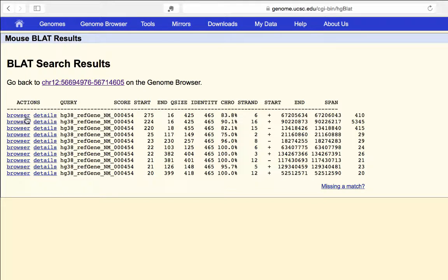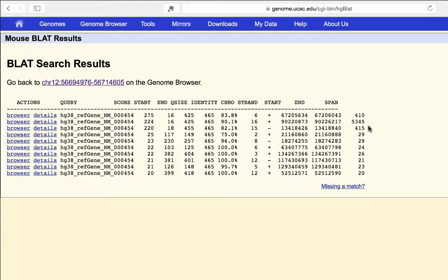Looking at the first hit, you can view it in the browser or get more details. The results show query size, percent identity, the chromosome where the hit was found, the strand, start and end positions, and the span. Among the top three hits with scores in the 200s, two are only 410–415 base pairs long and one is 5,000 base pairs long, which is suspicious.